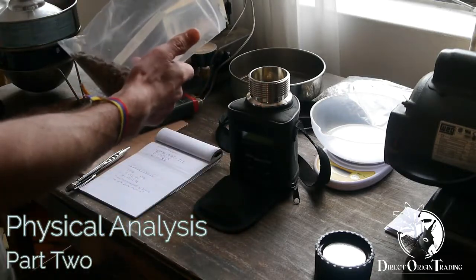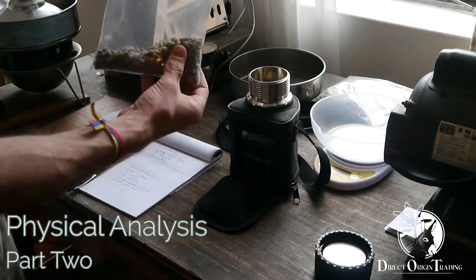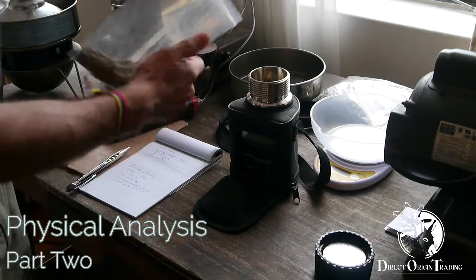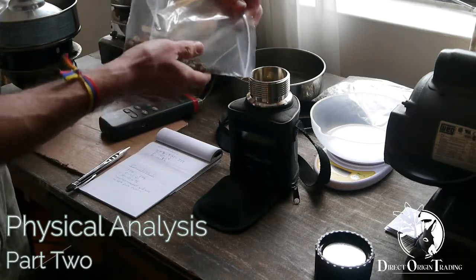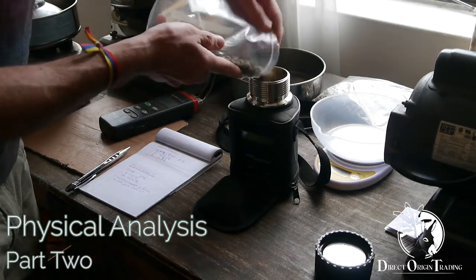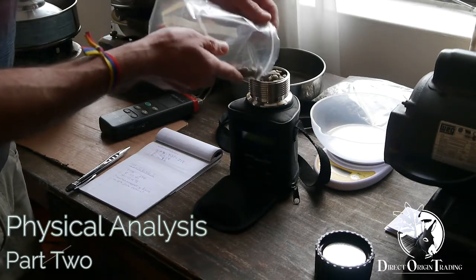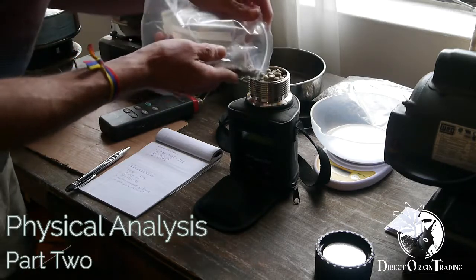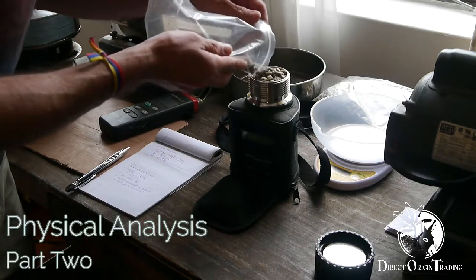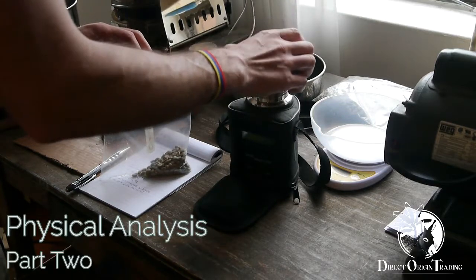So when the moisture content is high, the shells are just as dry as always, but the beans inside them are more wet, therefore more dense, and they weigh more, so that can make it seem like the yield factor is much higher than it would be had the beans been as dry as possible. We don't want too high moisture content, one because we're not even allowed to export it that way, and two because it will stimulate bacteria growth and then a premature spoilage of our green coffee.